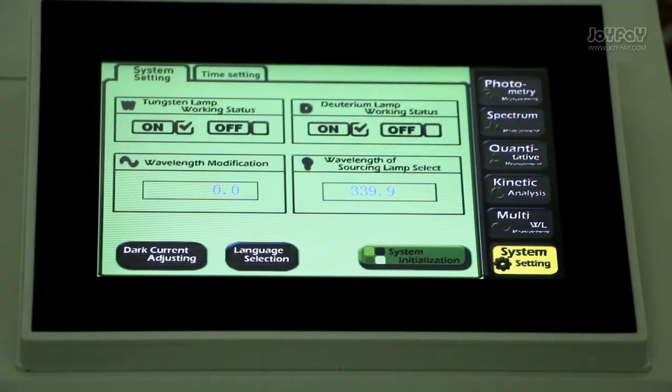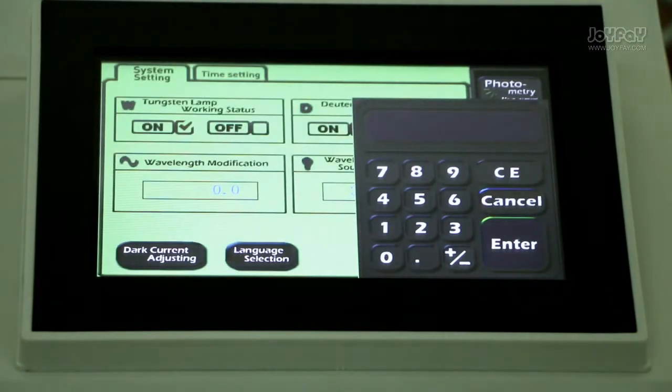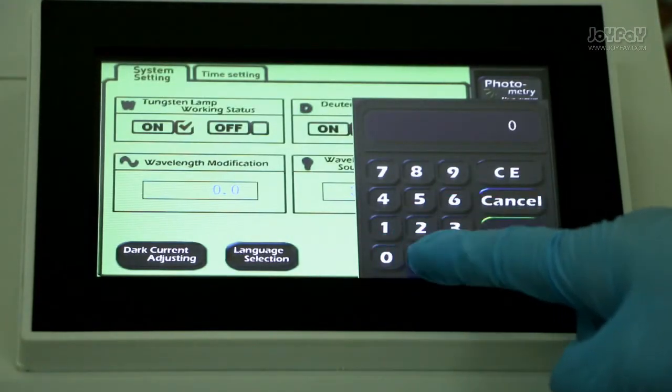Testing lamp wavelength. Wavelength modification. The wavelength can be corrected by you. Testing lamp correction value.